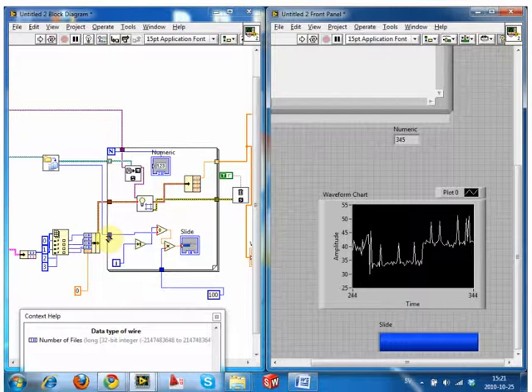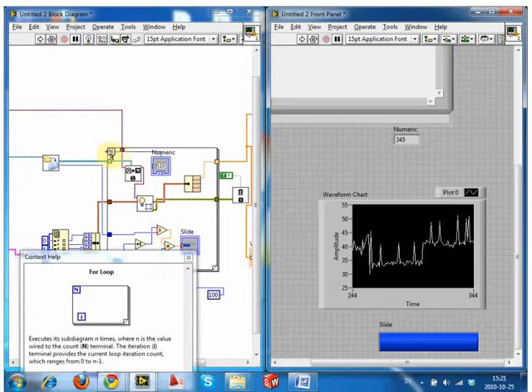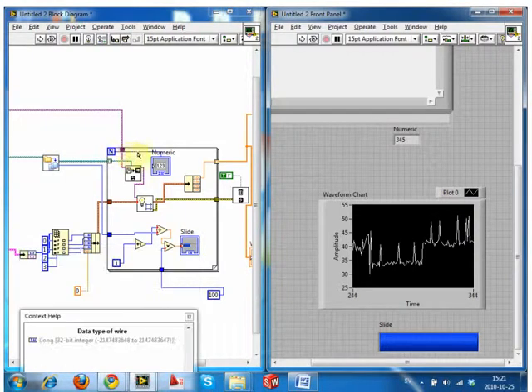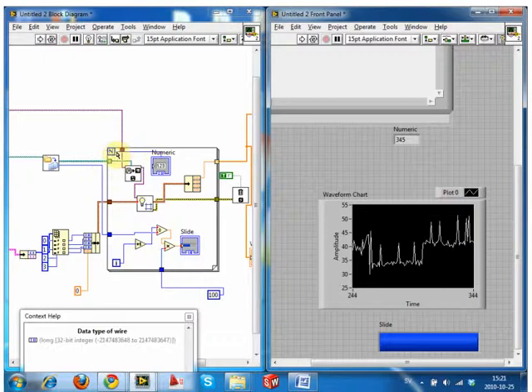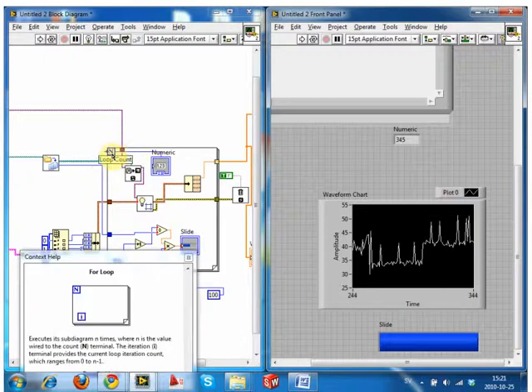Yeah, but you have to put it in anyway, so it's basically the same thing. You put this n number in with the index of the file list. I don't know where it's coming from. I don't want it to be reading this each loop, and if it's inside, it might be reading each loop.